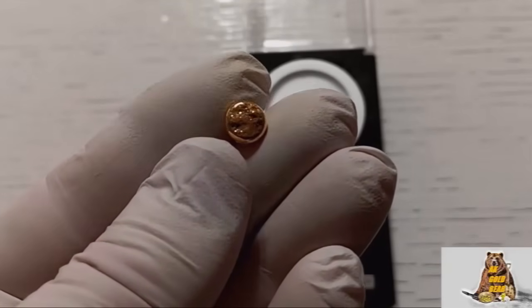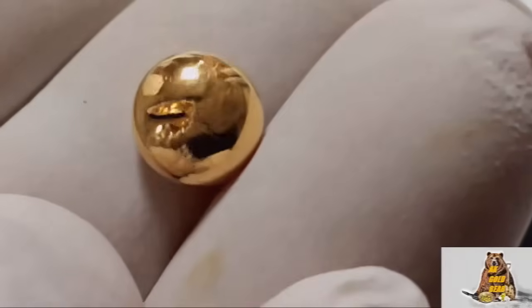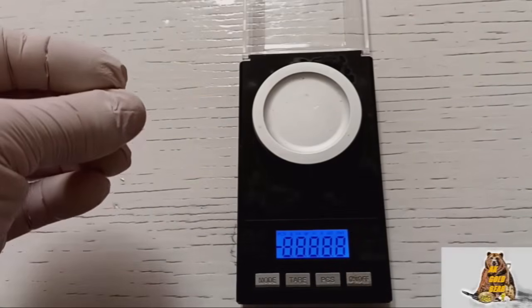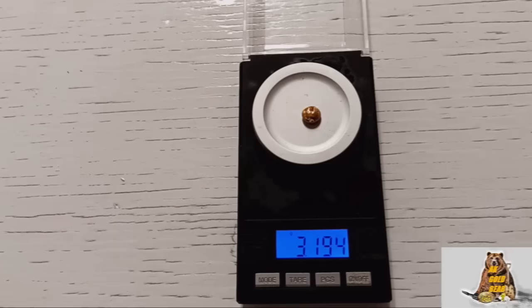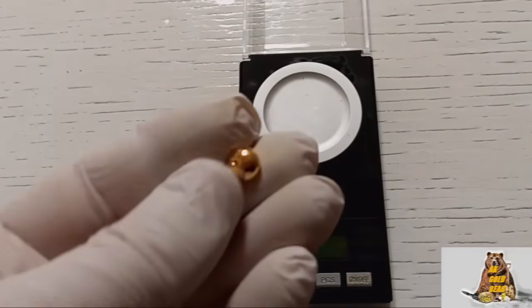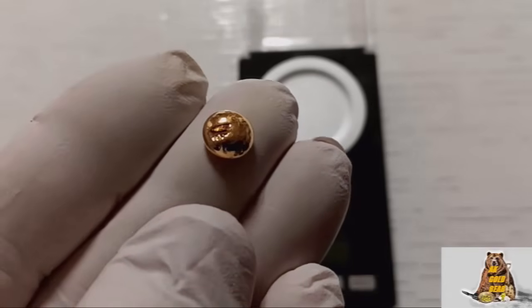A small gold button, pure gold with a mirror surface — 3 grams, 194 milligrams. 3.1 grams of gold out of 2065 grams of connectors, and that's exactly what I expected.